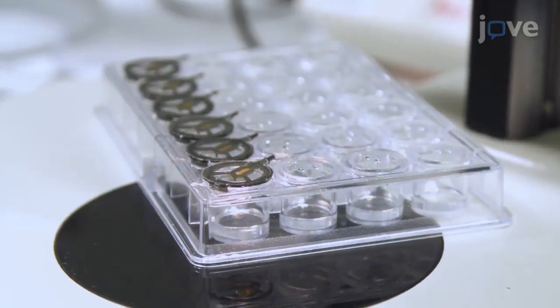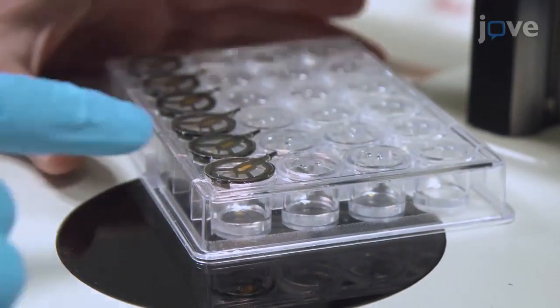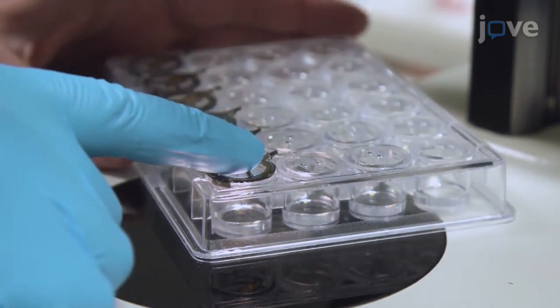The sample holder can be used for growing crystals and collecting X-ray diffraction data. This sample holder was made for use on 24-well plates, which are widely used in the MX community.